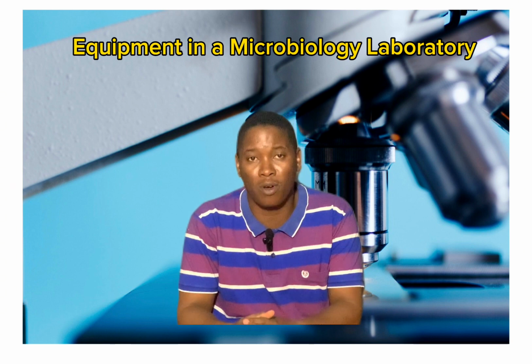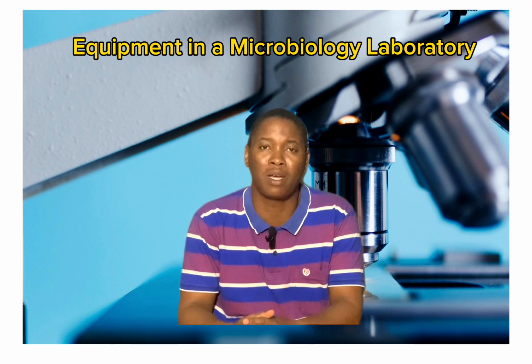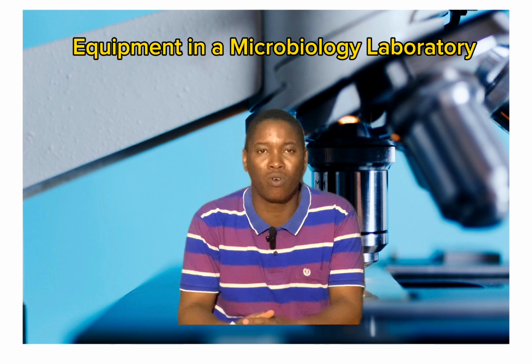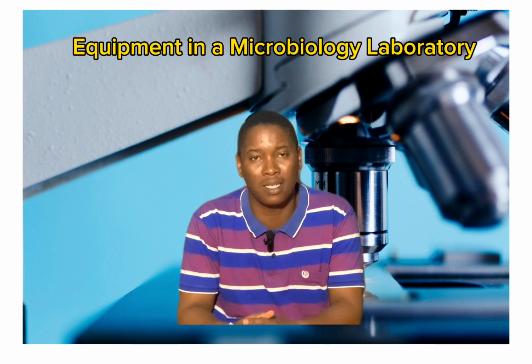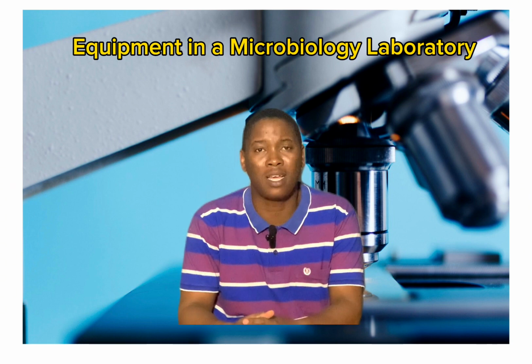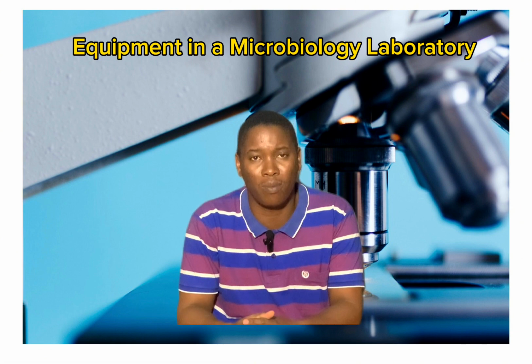Now, number one among these tools are the microscopes. What are microscopes? These are equipment that help to produce large images of microorganisms, organisms that cannot be seen by the naked eyes. There are different kinds of microscopes that are used in the microbiology laboratory.